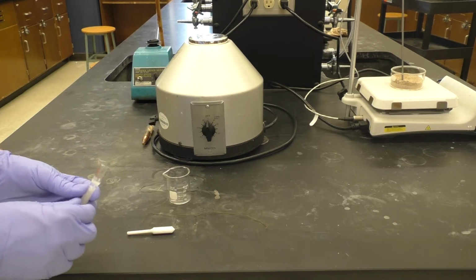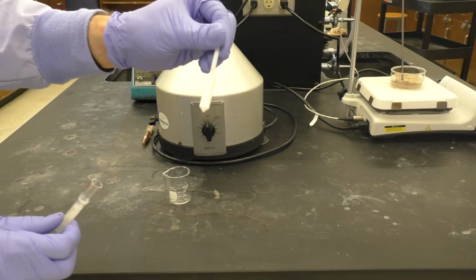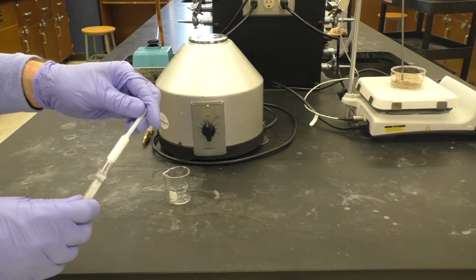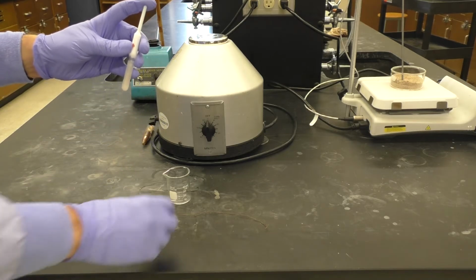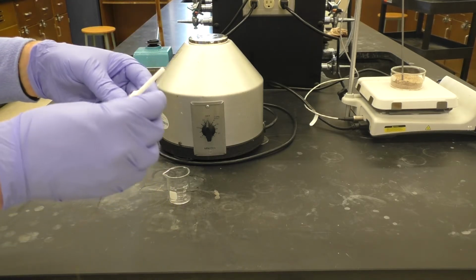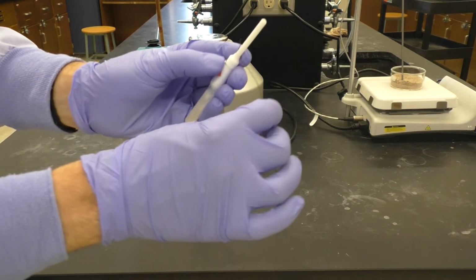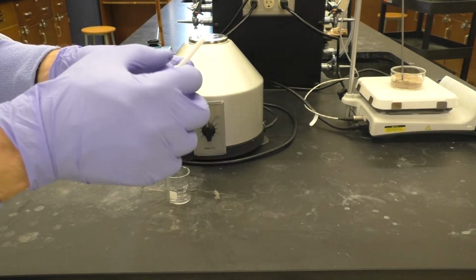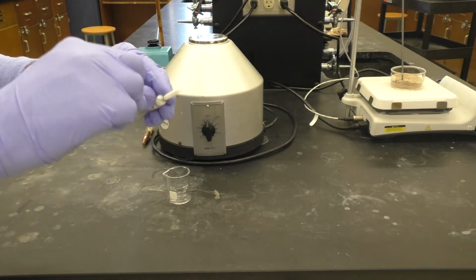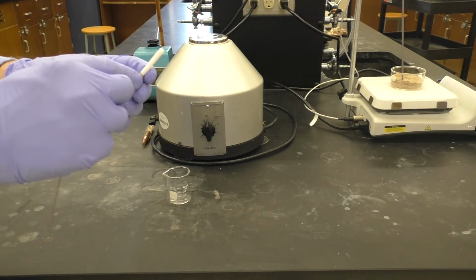To do this, we take a plunger, shown here. We simply insert that into the top of the Craig tube. It's actually designed for that. And then we'll take a piece of copper wire, and I'm going to wrap it around the top of the plunger, just where there's a little bit more of a lip. I'm going to wrap it around that lip there a few times just to hold it.